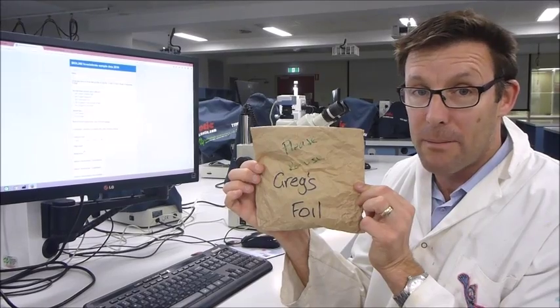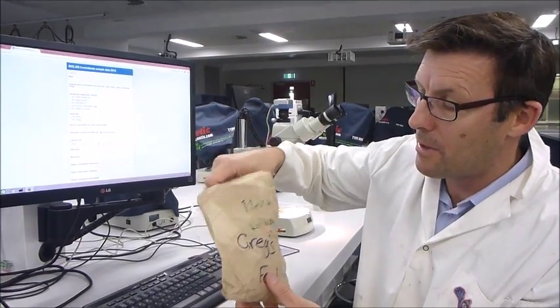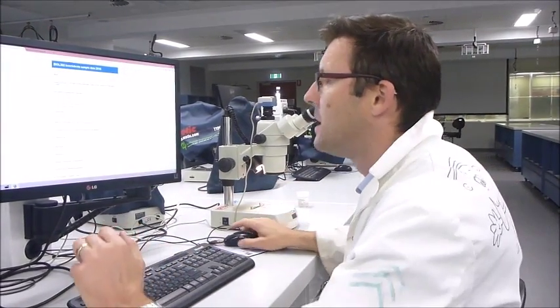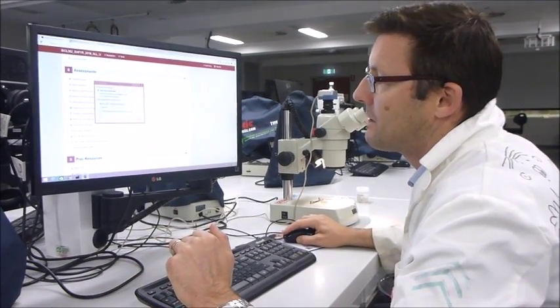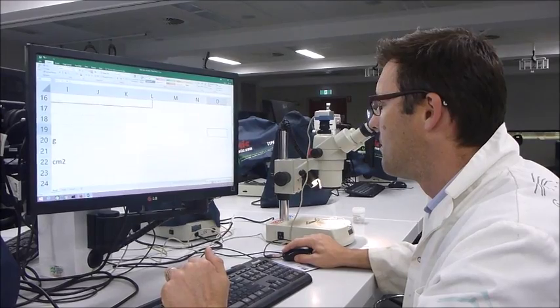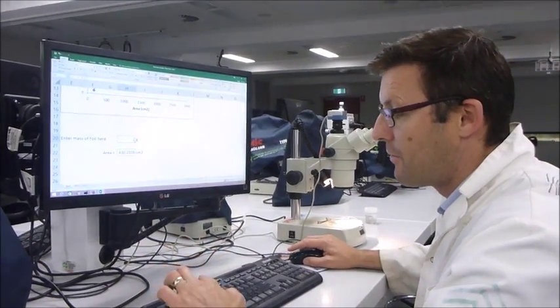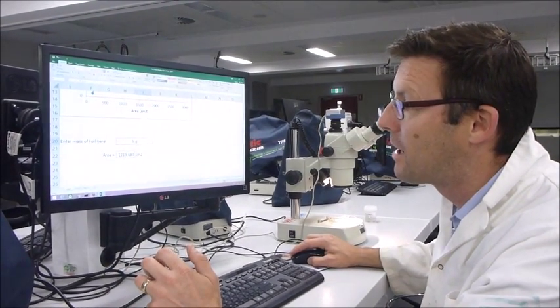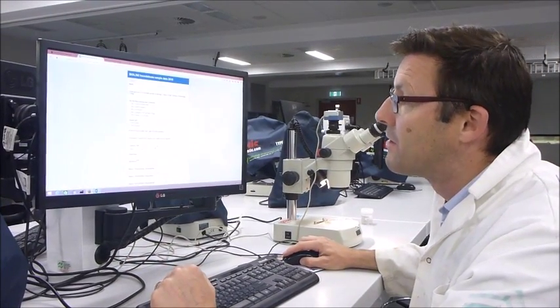Here I have my foil sample that I collected from wrapping up my rock, and I need to take my foil out and I need to weigh that on the balance. And also on iLearn there is a rock area calculator which will open up an Excel spreadsheet, and it allows you to enter the mass of foil here, so whether it was 5 grams, and from that it will calculate the area in centimetres square. You enter this area number into the Google Docs where it says rock size. This is for rock samples only.